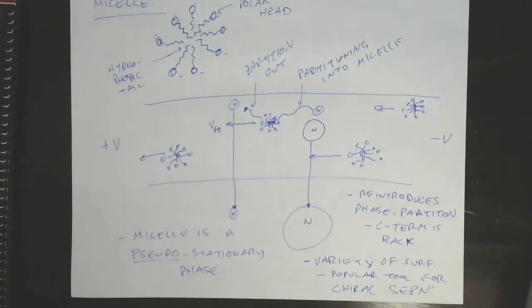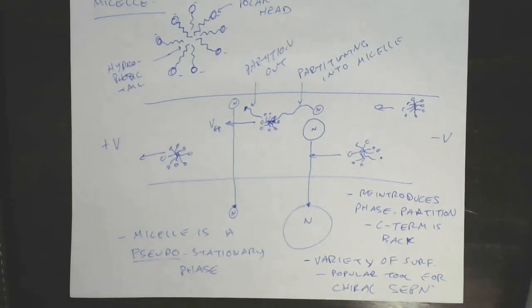Okay, this is MEKC. We're going to talk next about another limiting factor of CE that leads us to the topic of gel electrophoresis.